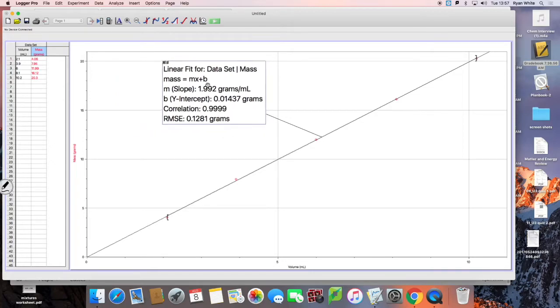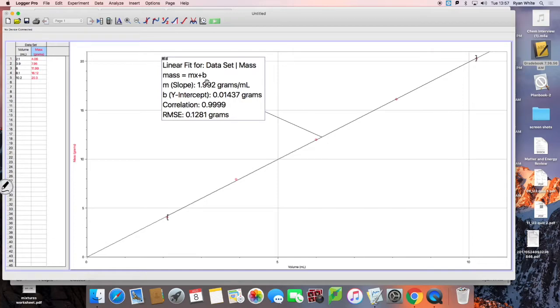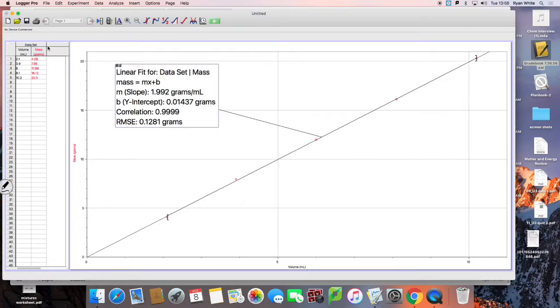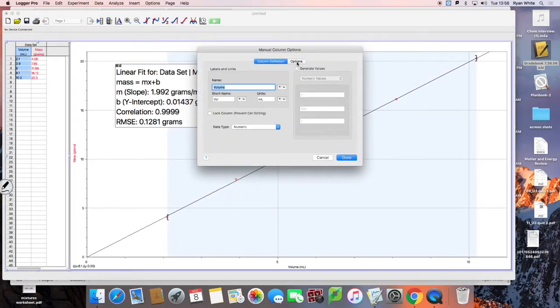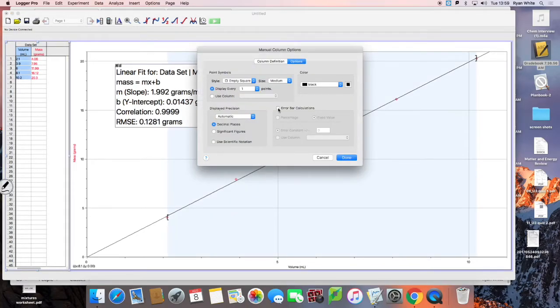I want to do one more thing — I'd like to add some error bars to show what the uncertainties are for the measurements. If you double click on the volume label and go to options, then error bar calculations in the bottom right-hand corner, I want you to put in the plus or minus that you have from your experiment.